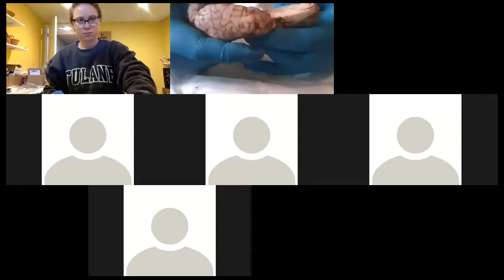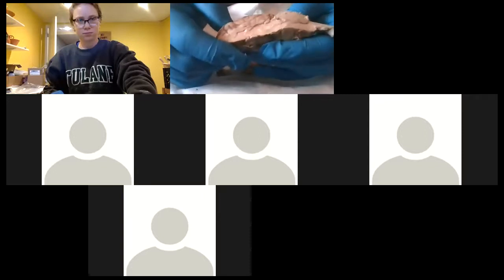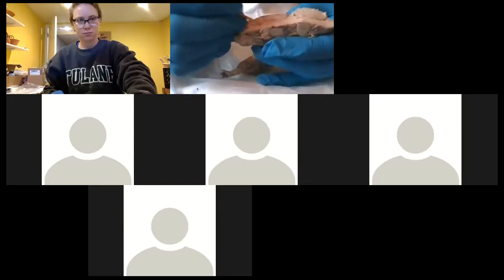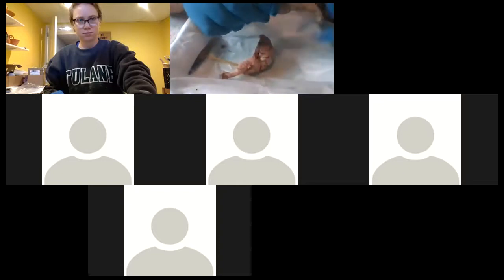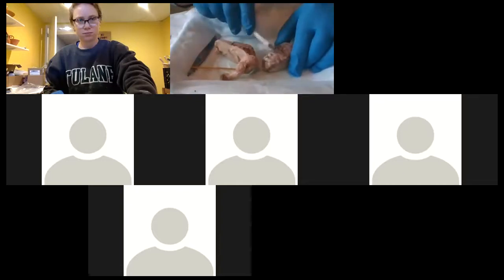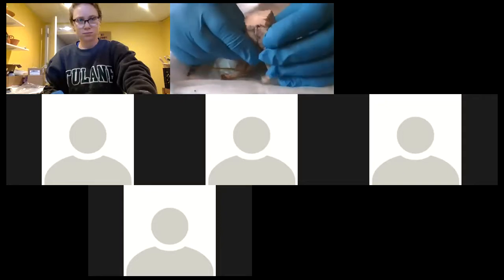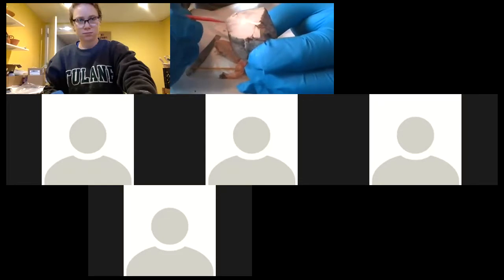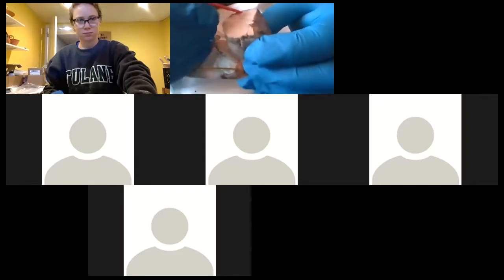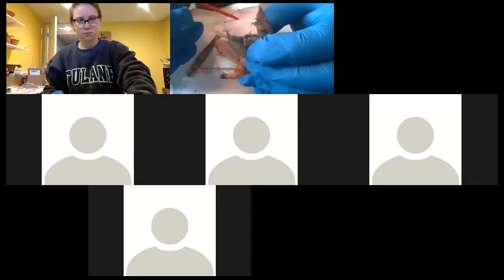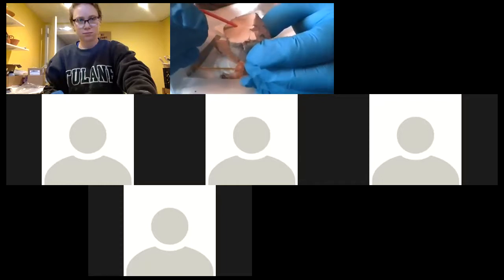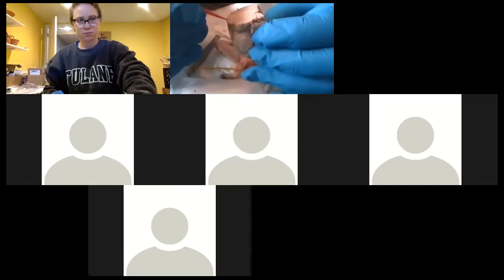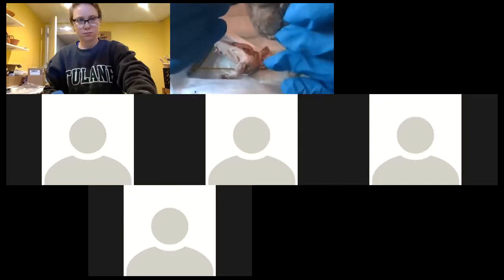So get a nice sagittal section if you haven't done that already, mid-sagittal. And this is pretty good too, this side is pretty much down the middle. It's only that one cut that you have to do. Just be gentle, you don't destroy any of the tissue. And if you have time, if you're interested, you could do a coronal section through the front. Maybe you could see, not so good here, if you really look close, you might be able to see some outer lying gray matter, which would be cerebral cortex, and the white matter. It depends on the preservation and the health of the sheep. This looks like a very young sheep. So it's not so well delineated. Mine anyway, but you can have a better sheep. You might be able to see the gray matter. I could just pick it up if the shade is right enough in here.